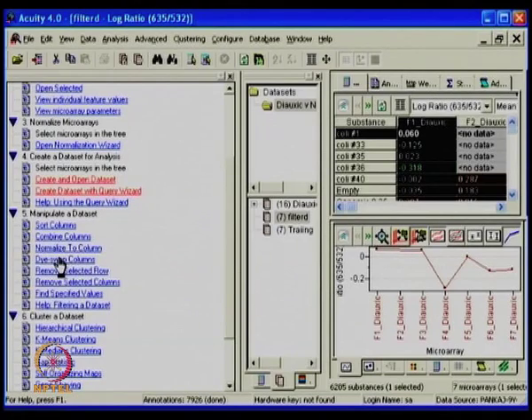So many a times you can also go for a normalized to column. The meaning is I am having a 0 to maximum, so I want all my data to get normalized to the first column. This feature is used when you are essentially using a time point. So all will be standardized or normalized to one column which you have defined as the 0th one.